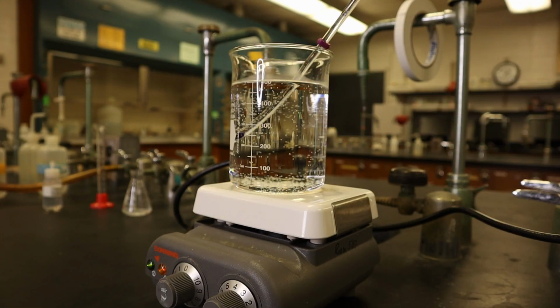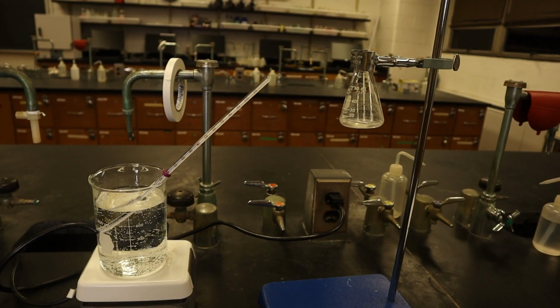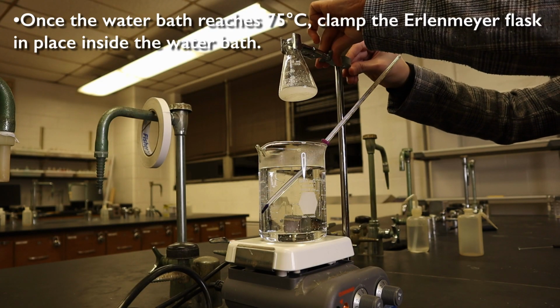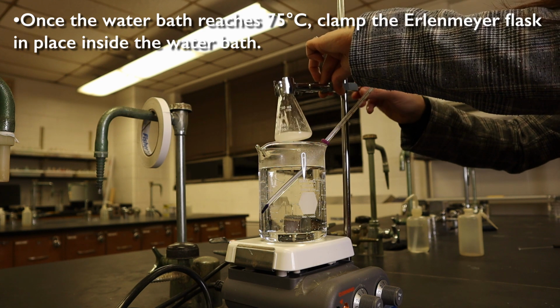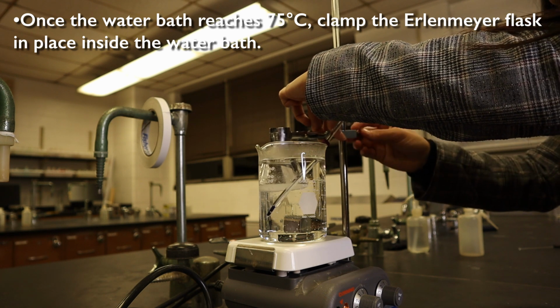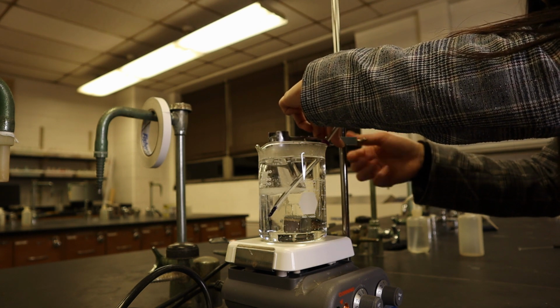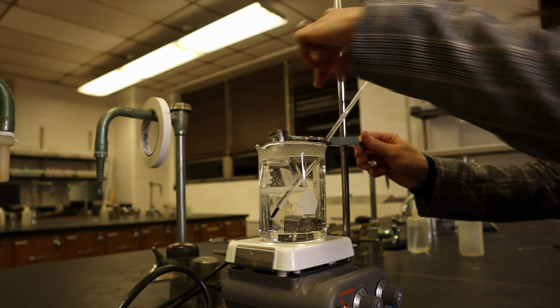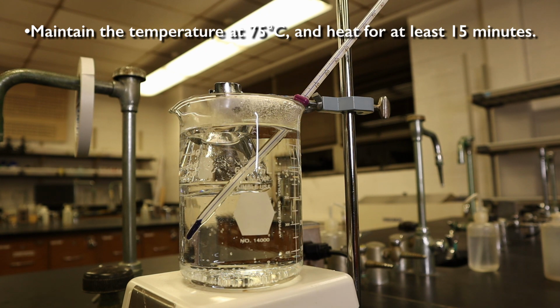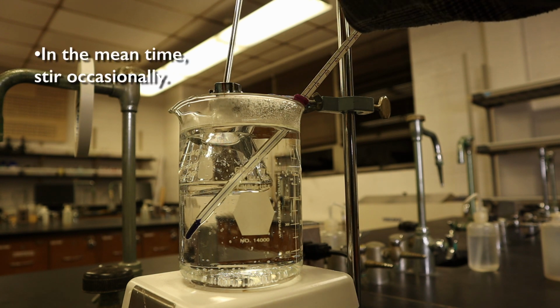Once the water reaches 75 degrees Celsius, we're going to go ahead and submerge the 50 milliliter Erlenmeyer flask. Our 50 milliliter Erlenmeyer flask is ready to go. Now we're going to keep the temperature at 75 degrees and we're going to wait 15 minutes. We're going to go ahead and stir occasionally.